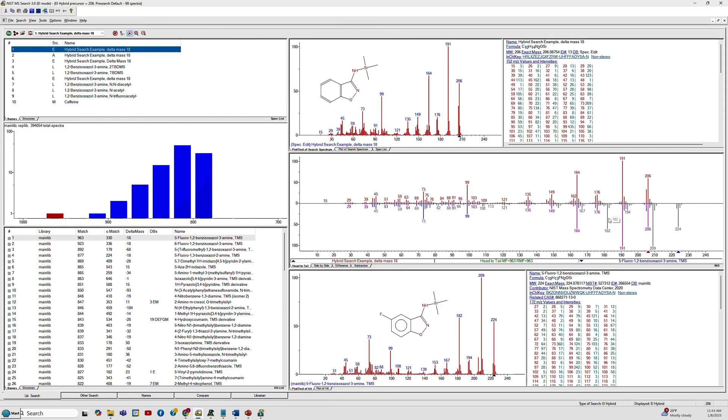In this case it shows that every ion that's been shifted in gray has been shifted to this color, for example for the 164.